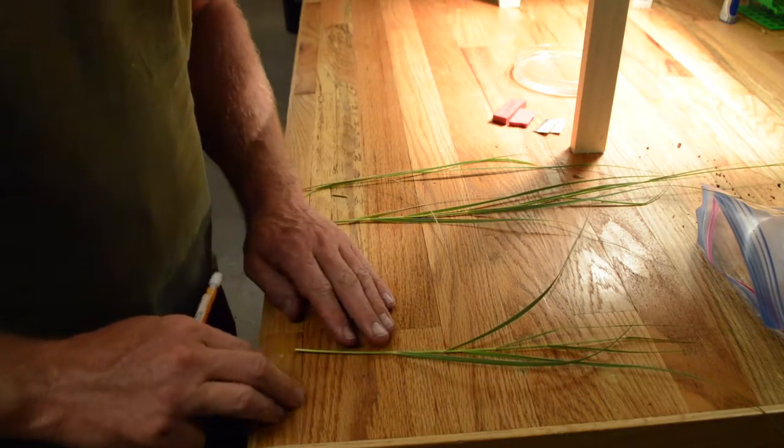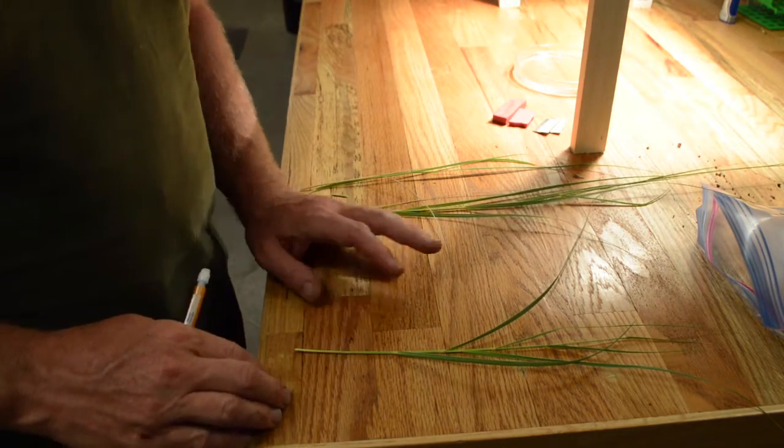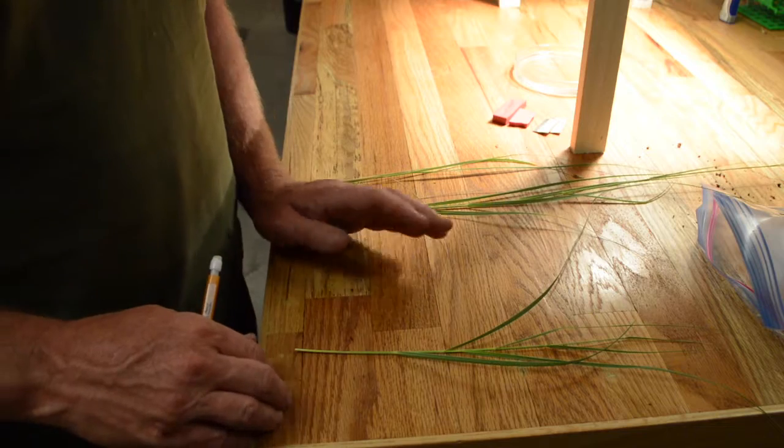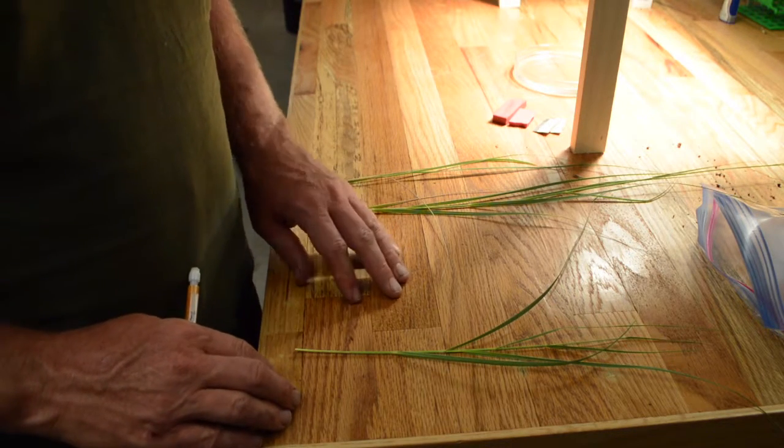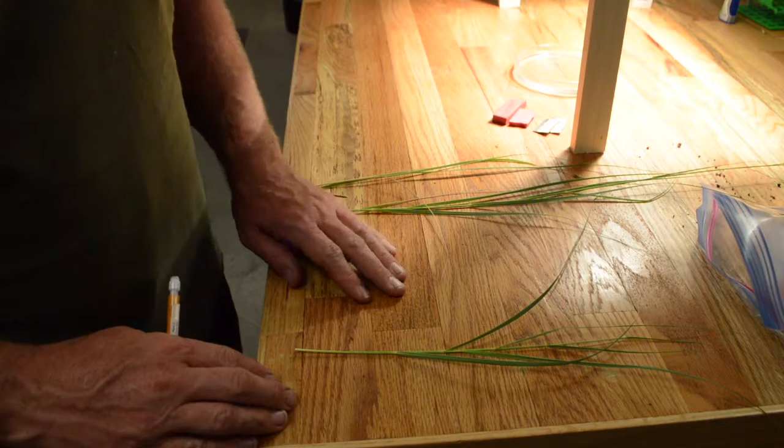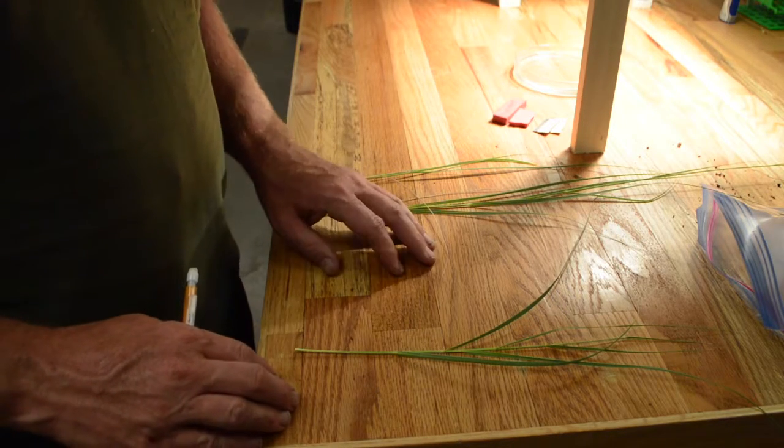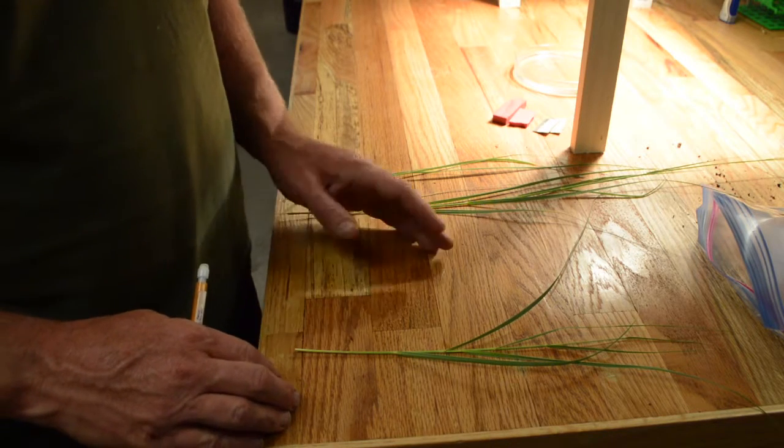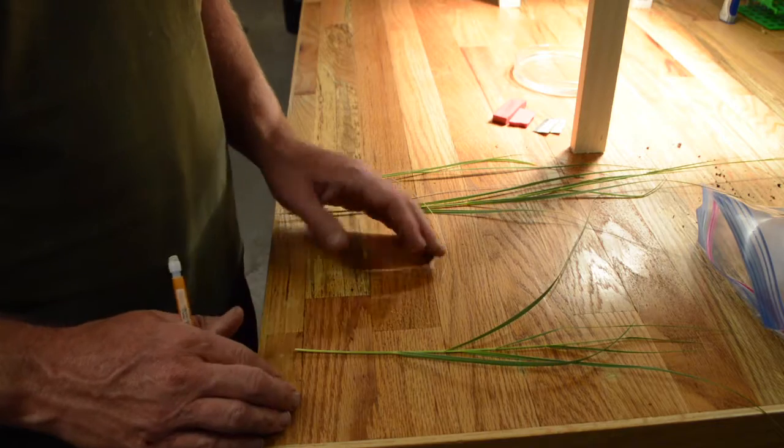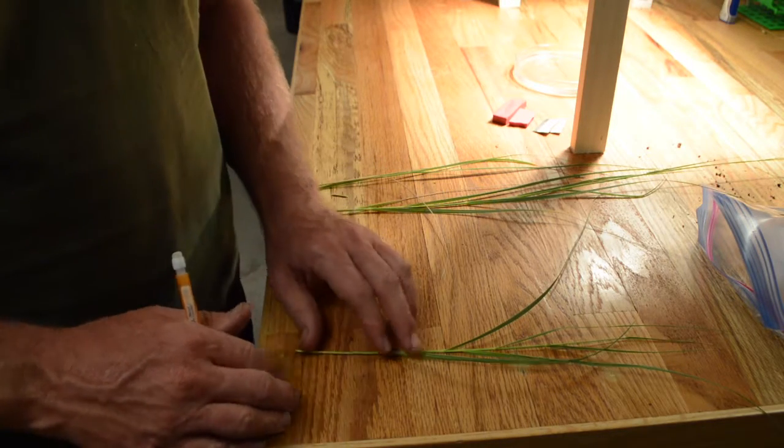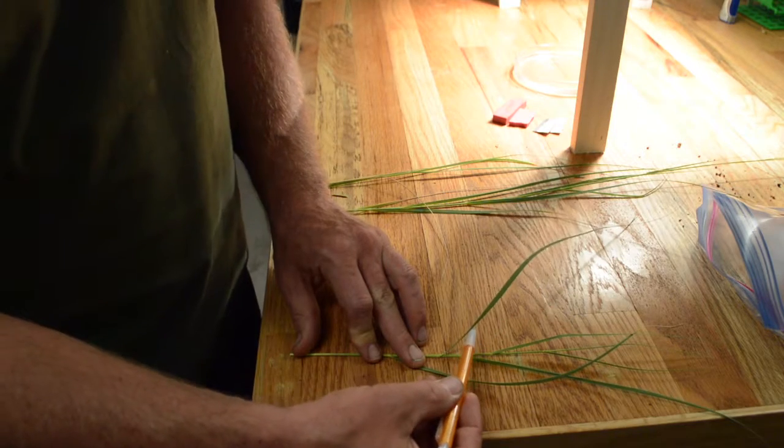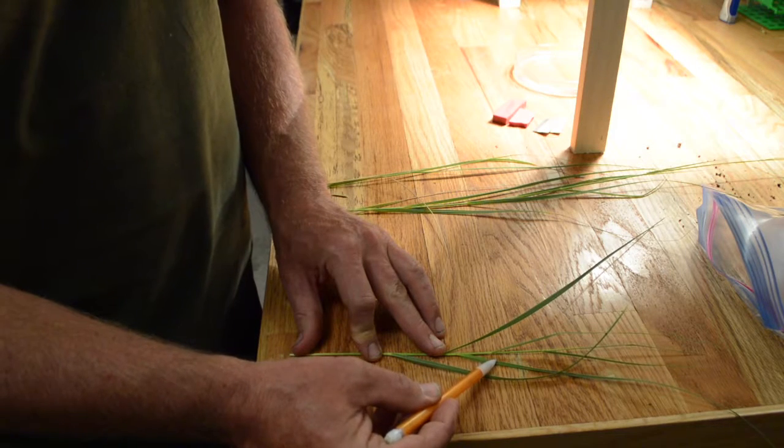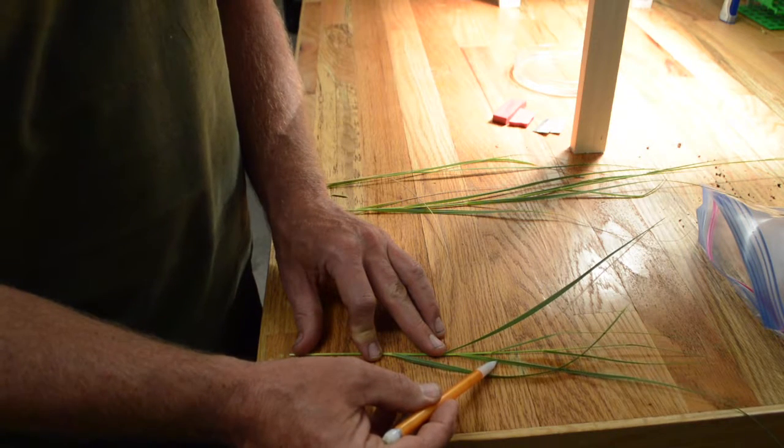Before I actually show you how to measure leaf hydraulic conductance, this is a good time to talk about one of the limitations of this method and one of the assumptions we have to make. If you remember back to the equation I showed you for estimating leaf hydraulic conductance with this method, you'll remember that there's a leaf water potential pre and post rehydration. Well, you can't make those two measurements on the same leaf. And so what we have to do is actually measure the pre-water potential on a different leaf than the post. So for example, I might cut this leaf and measure the water potential on it pre-rehydration. Then I would cut this leaf, allow it to rehydrate and measure leaf water potential on it post rehydration.